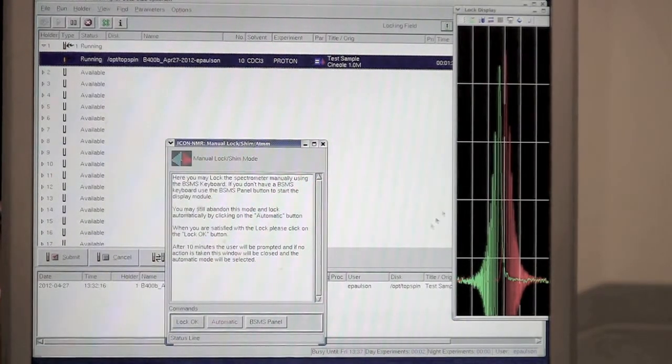It looks in a table and it picks a frequency that's correct for this instrument, and it transmits continuously at that frequency. This sweep back and forth here is sweeping the magnetic field up and down slightly. That's accomplished by means of a room temperature electromagnet that's inside of the superconducting magnet. So as it sweeps up and down, it goes through the deuterium NMR resonance.